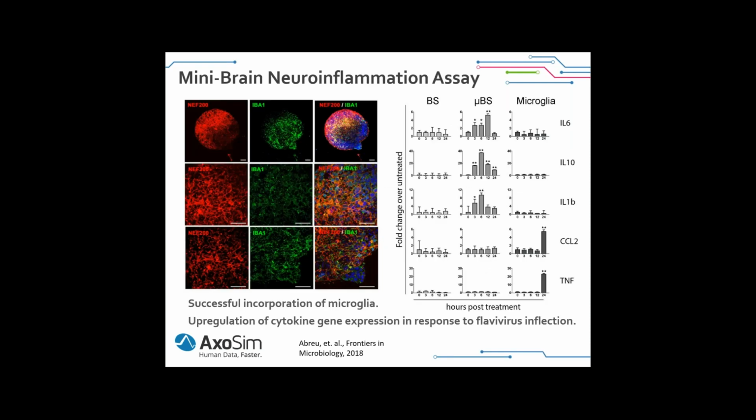Neuroinflammation is another set of work that's been done by the Hartung Lab. As I mentioned, that's something we're also building into our nerve on a chip, becoming more and more of a hot topic. It's being implicated in almost every neurodegenerative disease, which unfortunately affects almost everyone across the world. And so these are models that really need to be built.